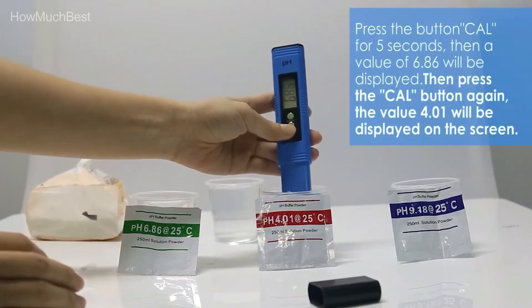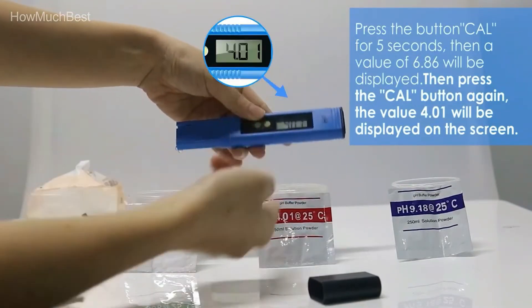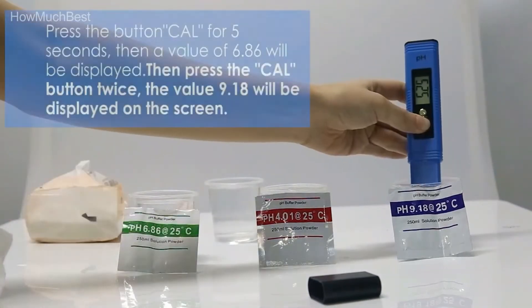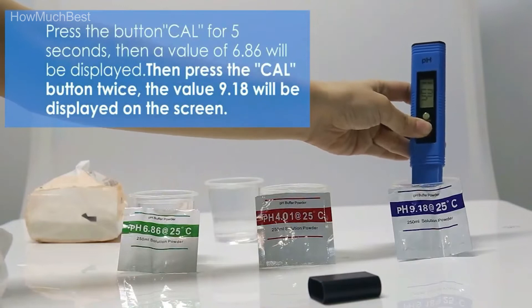Swimming pool water — the pH meter may help us monitor the water quality of the pool at any moment to ensure safety and let our household swim with confidence. Here is item number 4.